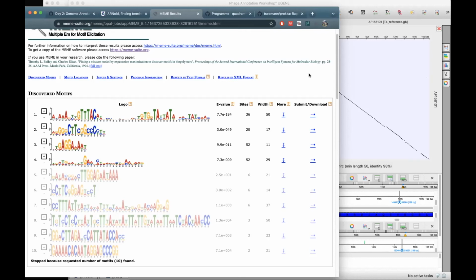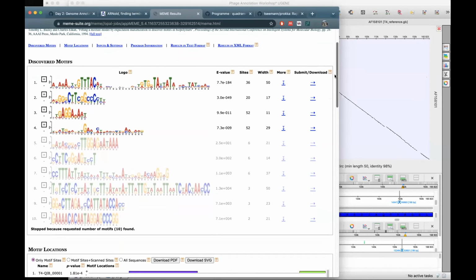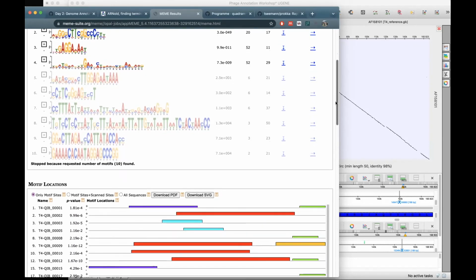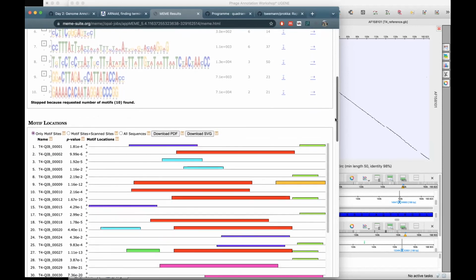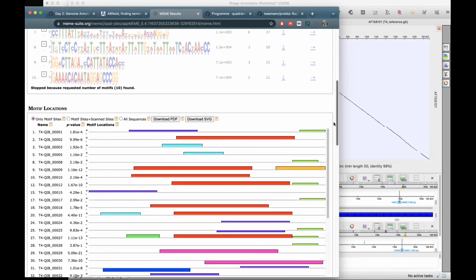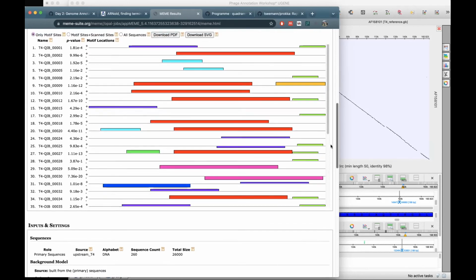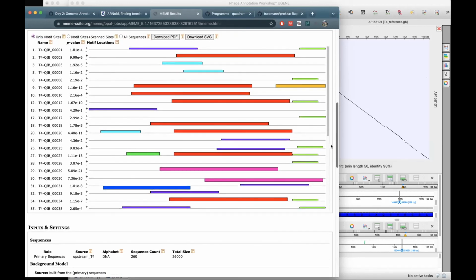It has a set of genes, it's well characterized. So we actually know already all of the locations and a lot of the promoters. This is just a way to do it. Now we did it in a pattern agnostic way.